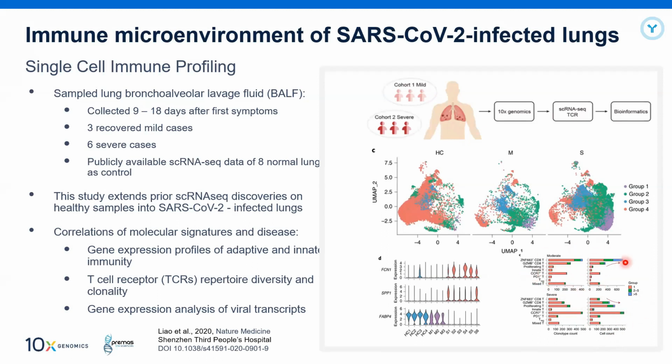In the moderate patient, we are able to see that expansion happening. So there are a lot of stories about what exactly cell populations are working in a milder cohort and in the severe cohort. We can figure it out using single cell technology, which we were completely missing when we were doing normal NGS or normal flow or any other workflow where single cell resolution of data was not generated.